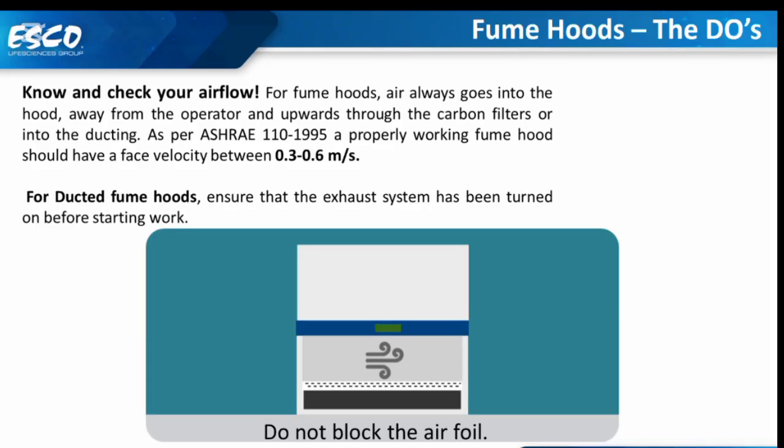For ducted fume hoods, ensure that the exhaust system has been turned on before starting work. Because remember, the exhaust system, which is the exhaust fan, has to be on so that the airflow is also on. The fumes are pulled away from the operator.